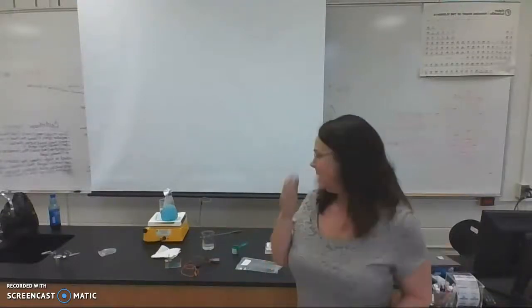What I'm showing you is Lab 3, the second part of Lab 3, the gel electrophoresis part.